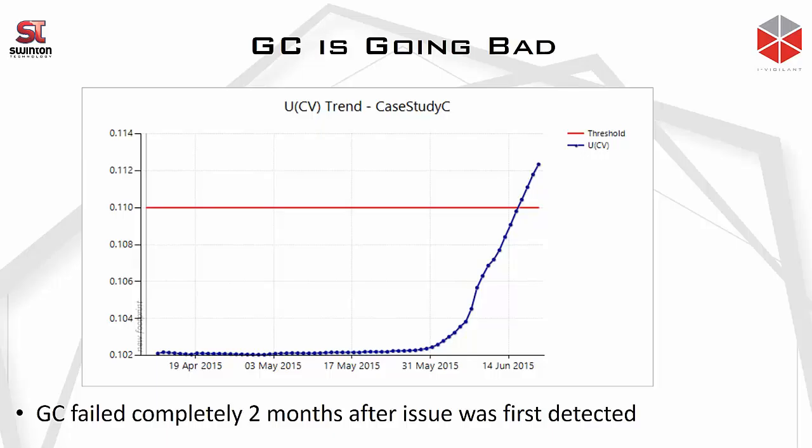The reason we have an uncertainty budget with such a high tolerance is because the standards we have at the moment, I think probably because of the lack of technology we had earlier, specify a tolerance that is very, very wide. For instance, the ASTM D1945 standard gives a tolerance for methane of plus or minus 0.1%.